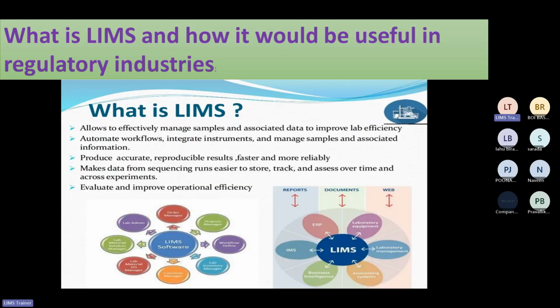Now what is LIMS? Basically, it allows you to effectively manage the samples and associated data. So basically, laboratory means what?